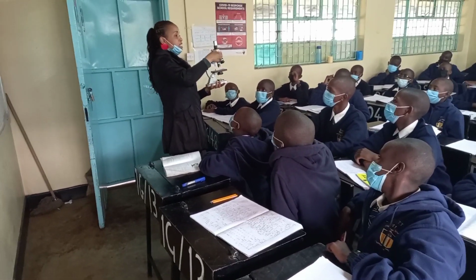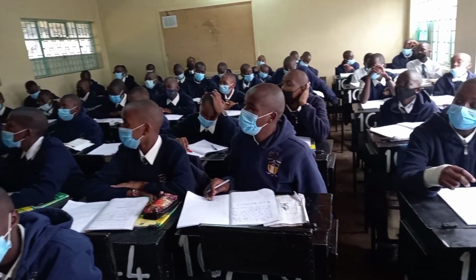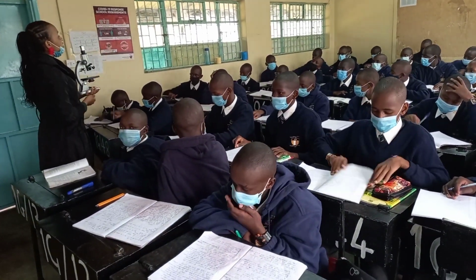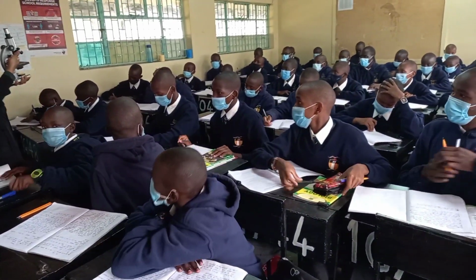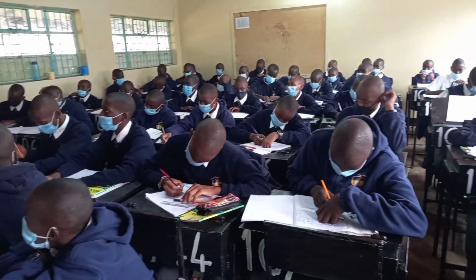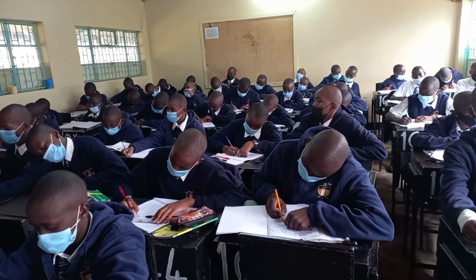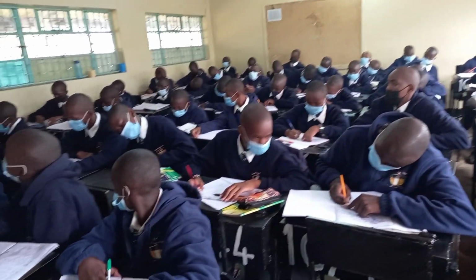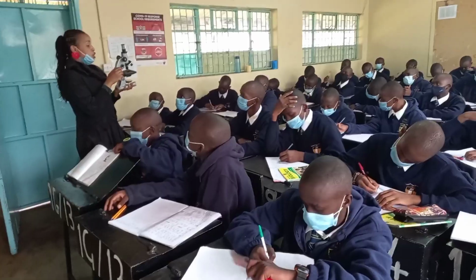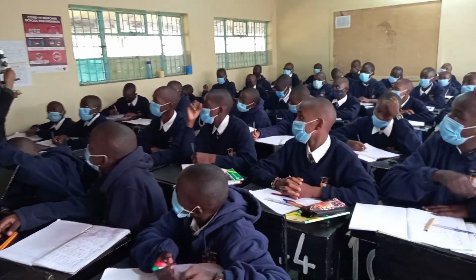Then sometimes we place the specimen on the stage with a slide, and the slide is made of glass. So what will be the reason? To prevent crashing the lenses and also crashing the slide on the stage, because you have seen the high power objective lens can reach down. It's longer than the rest. Is that understood, people? Yes. When you're using the high power objective lens, you only use the fine adjustment knob.